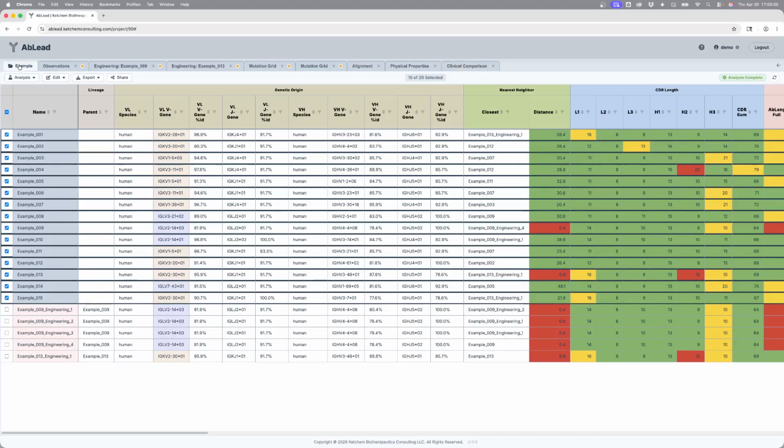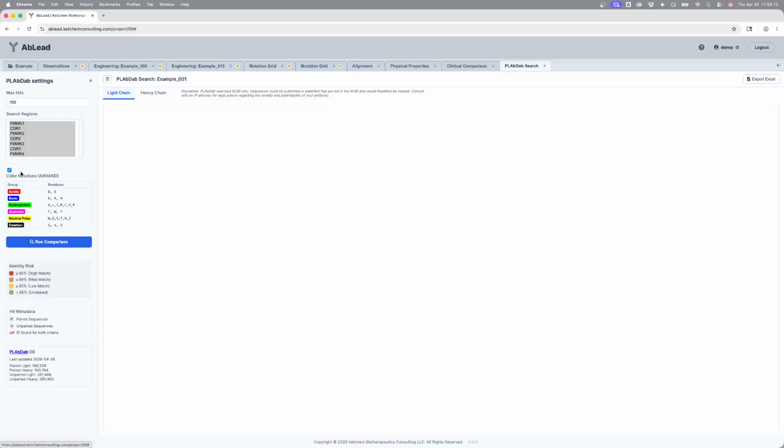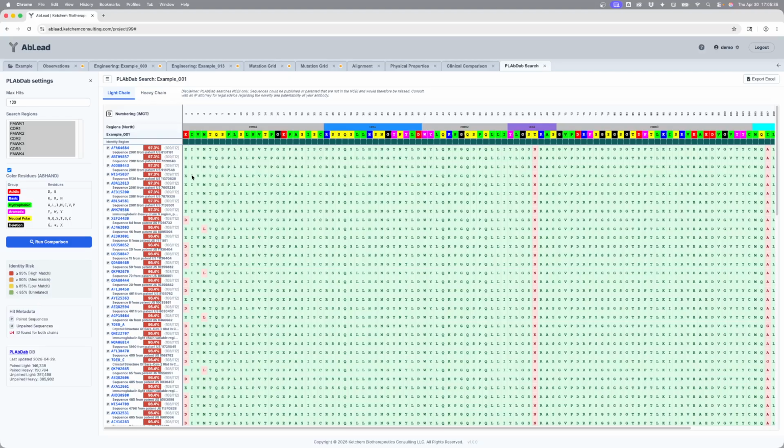One other attribute that I'll show you is done on a single molecule, and it's incorporating the Oxford Protein Informatics Group protein or patent and literature antibody database search. This uses the data sets from that OPIG tool, but does it all internally, so you're not putting your sequence up into a non-private cloud. I don't think that they would use or share your sequence in any way, but if you want it to be internal, here it is internal.